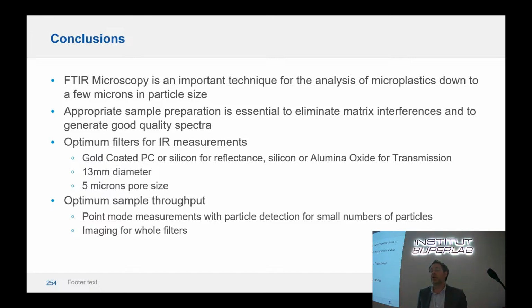It's a good point to bring up. It does depend on the orientation of those polymers. If you have a lot of irregular ones, you start to get interferences, and then actually it's not ideal. I probably should have brought that up. You saw a slide earlier where people talked about how sometimes you get orbs, sometimes you get fragments. If they're all the similar type, reflectance works well. It's when you have different types that you start to get interference from the different samples, and then reflectance is not good. You would do transmission or ATR. That's a good point.